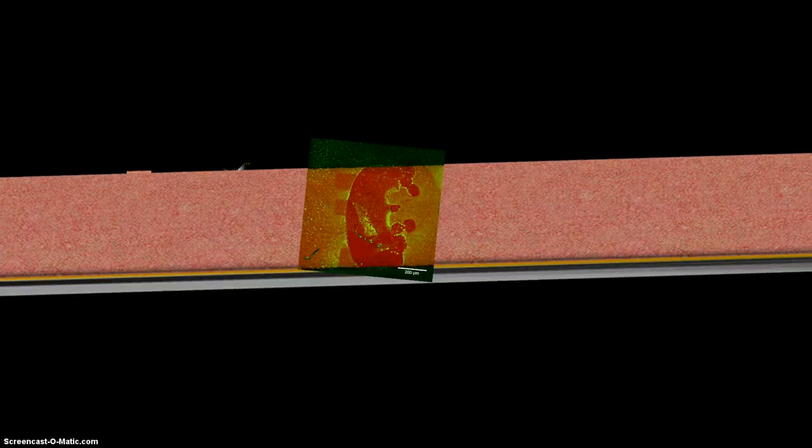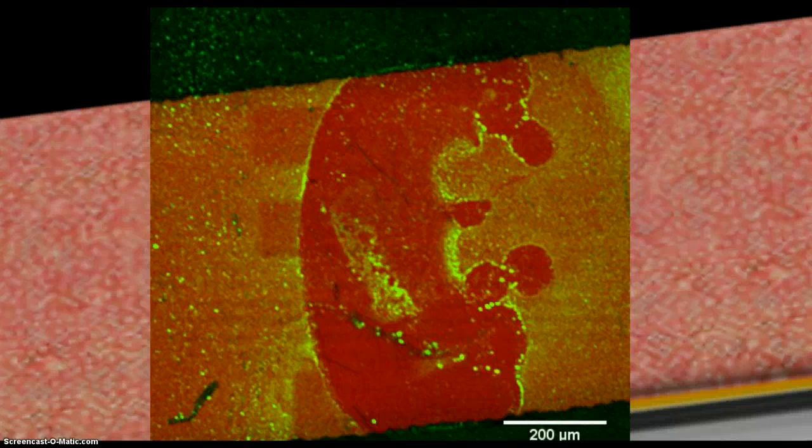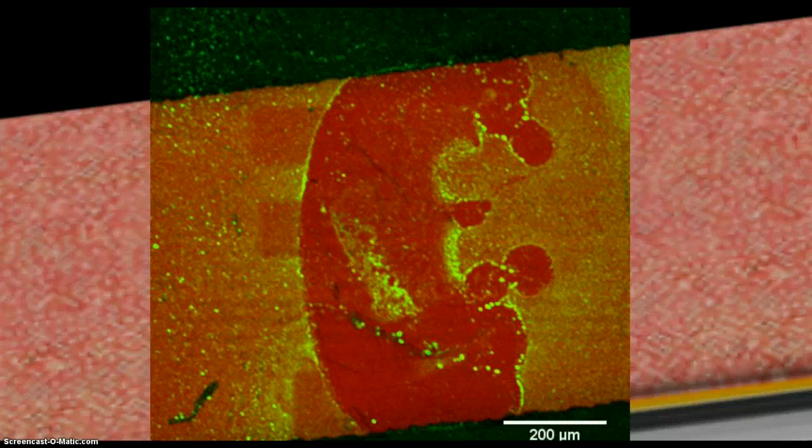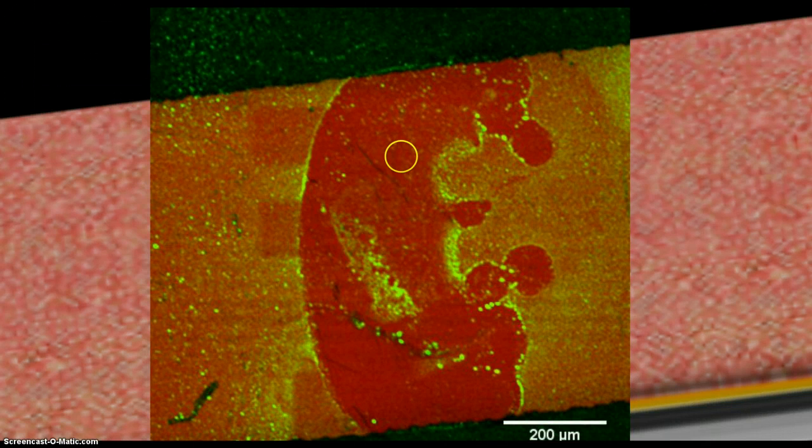Using confocal microscopy, we can get a better picture of what the membrane actually looks like. In this picture, we have added a fluorescent membrane dye to our tethered bilayer lipid membrane. We then proceeded to vigorously perforate some of the membrane, revealing the reflective gold surface.